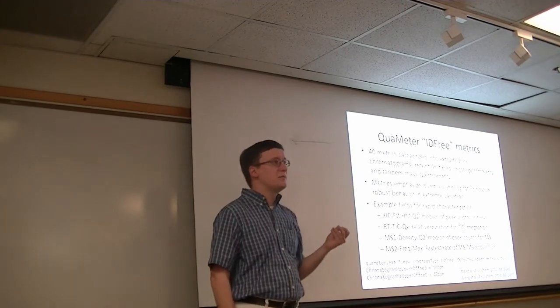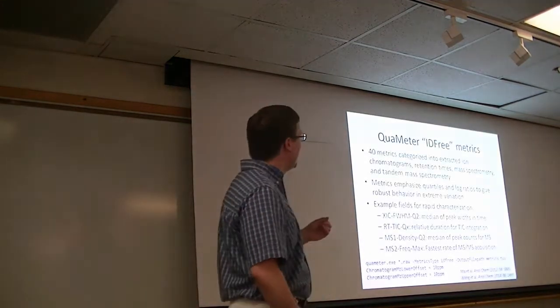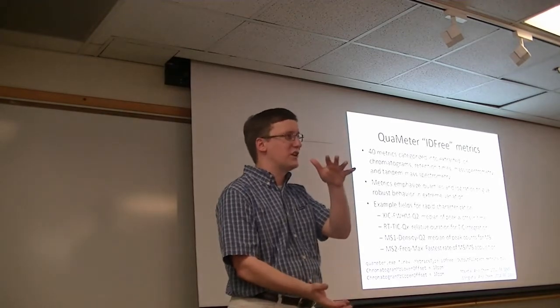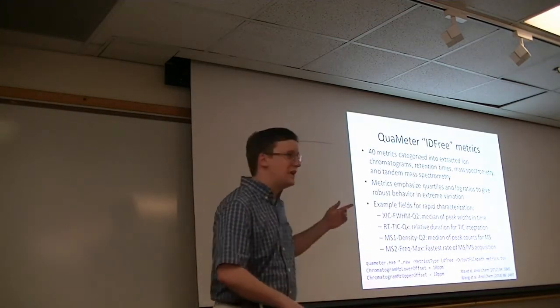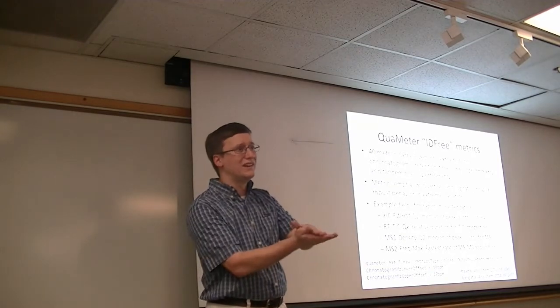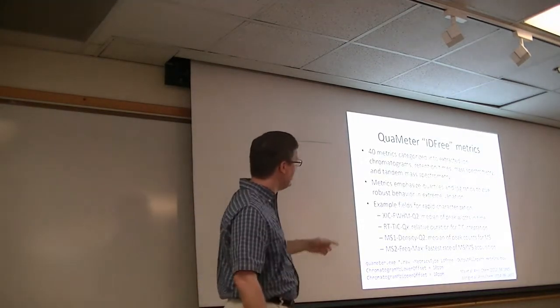Next, we need these numbers to be evaluable over a long scale. If you're dealing with intensity, you may have very large ratios produced by the intensities for a given instrument. So anytime we're talking about intensity, we're almost always doing it on a log ratio scale, which means our numbers don't suddenly go to extremely high or extremely low values. It makes them a little more robust.